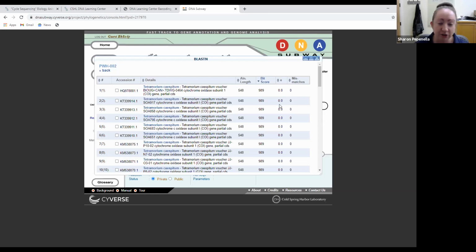What that essentially means is that there's almost 0 probability that the results we've obtained from these 50 closest matches are due simply to random chance or some sort of background. So very, very small numbers or 0 is what we're looking for in the e-value. For the majority of your barcode samples, you're going to get something very, very small or 0 here. The bit score is also a measure of chance, but it looks at the sequence quality independent of the actual query length of your sequence and independent of the database size. So the higher the bit score, the more significant the matches are. These are high bit scores. Usually they'll be maybe high 600s, 700s, 800s, 900s, or even 4 digits long. I don't have a great cutoff for what's considered a low bit score. I was told once that as long as it's 3 digits, generally that's considered a good bit score. But what we're seeing here is generally pretty typical of a good bit score.